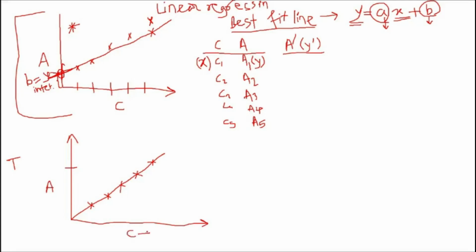Okay, so what you will do, you will take its absorbance, so that absorbance will have some value on your y-axis. Now what is your task? How to find the concentration of that absorbance? Anybody in the chat box, please tell me. You have the calibration line with you. You have the absorbance of the unknown. Okay, most of the students are saying it's correct. You have to do interpolation. So if I do the interpolation, where the perpendicular comes on the x axis, that will be your concentration of test.